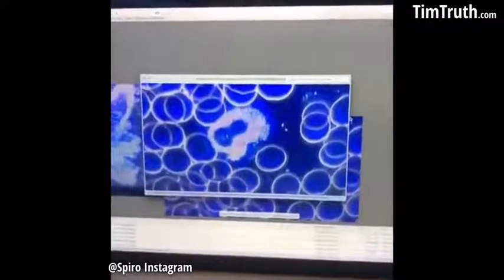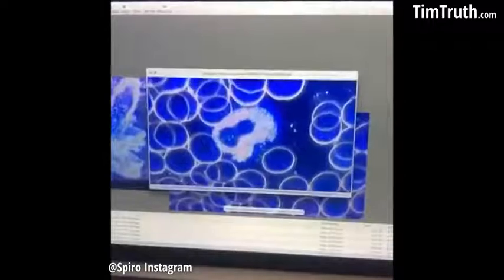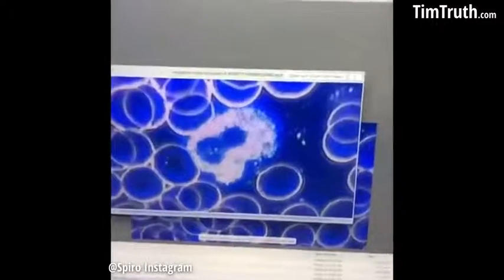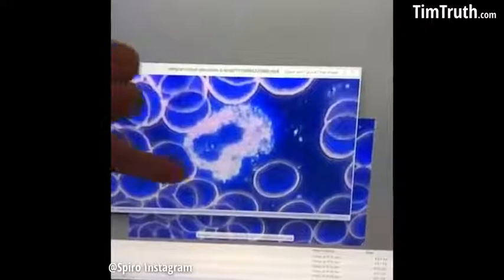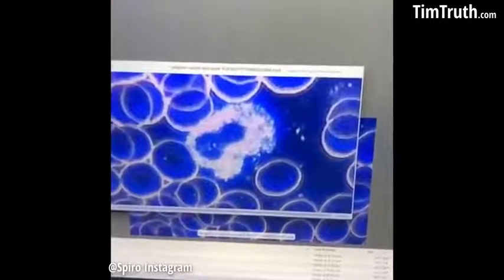So this one is a video. Let's enlarge it. This is actually really difficult to explain because it's a white blood cell, but also here very unusual how it comes out. It's not normal to look at this, and these overactive movements in this cell.